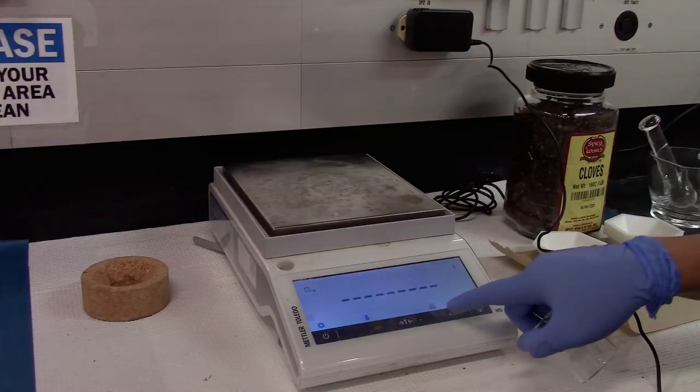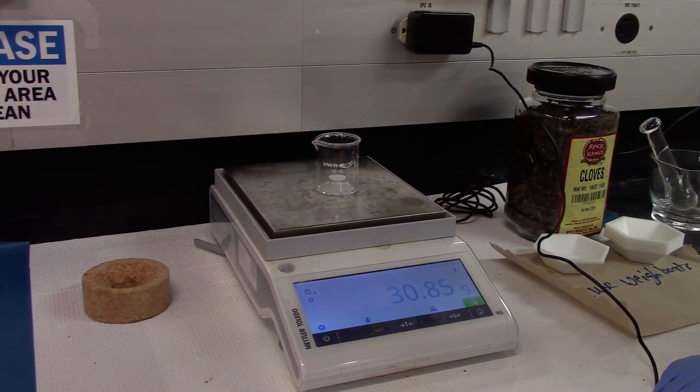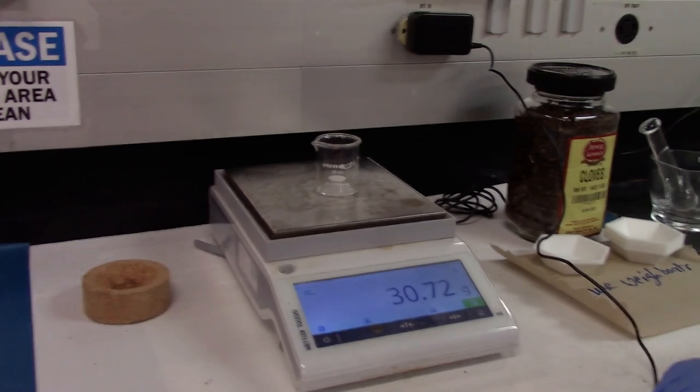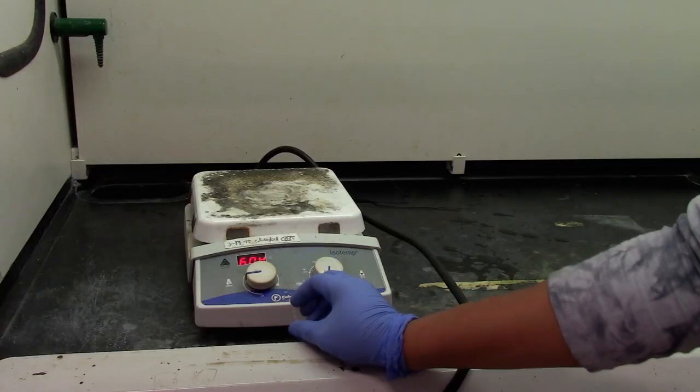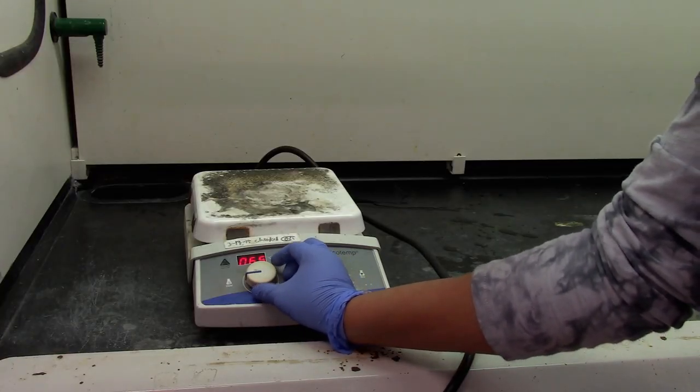Go ahead and weigh a clean, dry 50 ml beaker. And set up a hot plate at about 75 degrees Celsius.